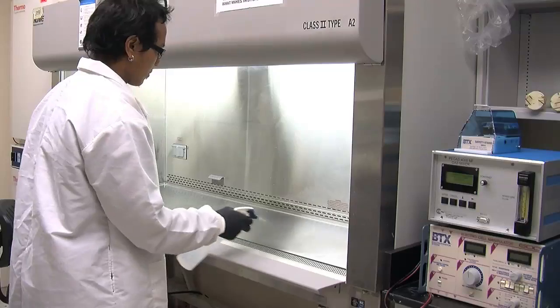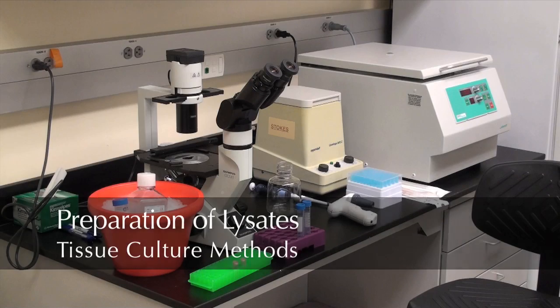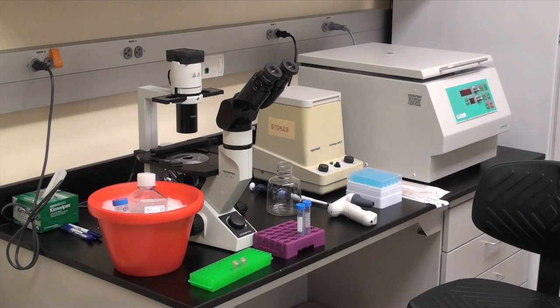The most important thing is to clean up after. Preparation of cell lysates: set up your instruments and buffers.